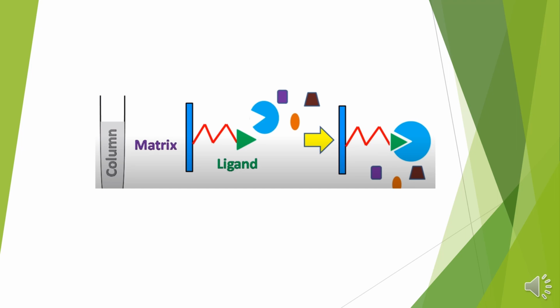This is the structure of affinity chromatography, where it shows the column on the left side. That column contains the stationary phase and the mobile phase. In that, we are introducing the matrix, spacer arm and the ligand. These three are interconnected, and this complex will go and bind to the target molecules like enzymes or antigen, as I informed you in the previous slide. Once it binds, it gets eluted from the column by the displacement method. It is used for purification of enzymes and separation techniques, etc.